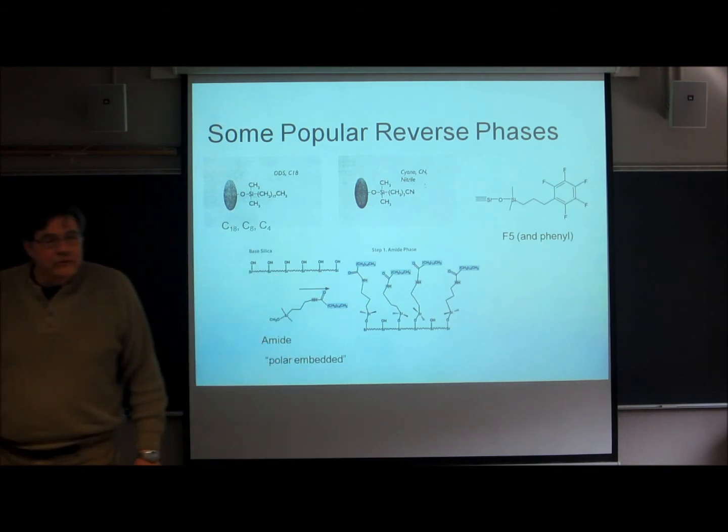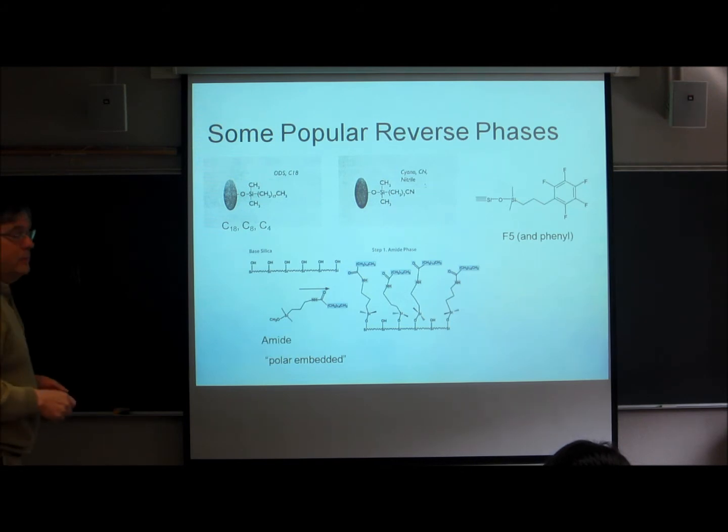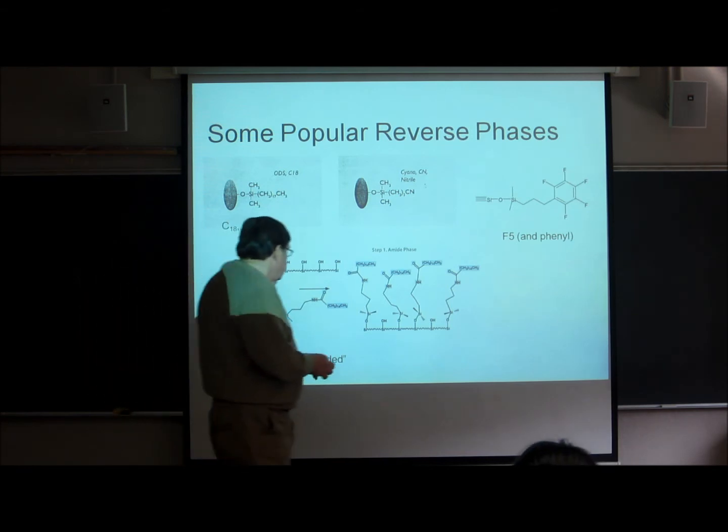Now what do you suppose its properties are like? Now you have to understand that amide is a base. Oh, a base, so maybe it will get protonated. So you might think it could attract more acidic compounds, maybe. But what else? What do you suppose the effect of the long chain sticking out is? To modify that behavior and give you what we call a mixed mode of selection, where both oiliness and charge are involved. And once again, this is a kind of compound that you might look for if you had a particular separation that was not performing very well with the C18. Polar embedded.